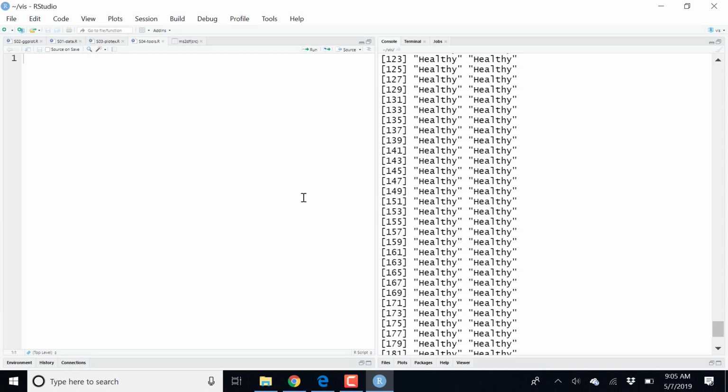So, a relatively long chapter, and the point here is to explore different tools, different kinds of plots, different transformations, different data reduction methods, or clustering methods that are regularly used on biology or high throughput biology data, and to see how we can apply these, learn the R functions to apply these, and how we can extract different information to further explore and visualize and understand the data.